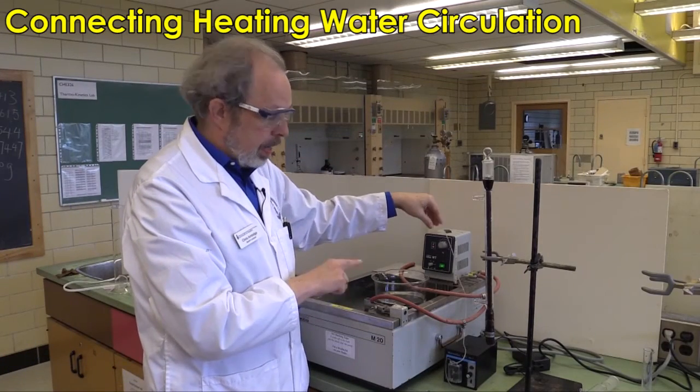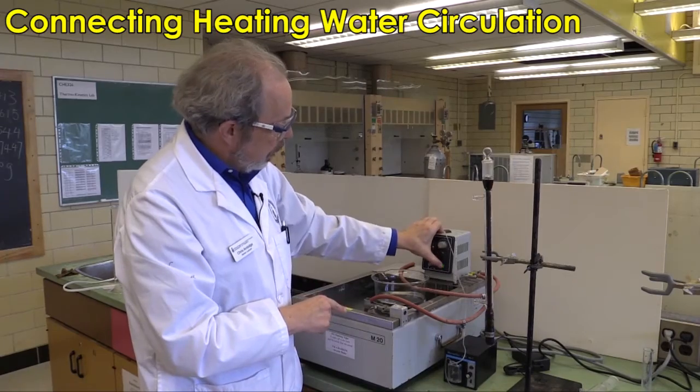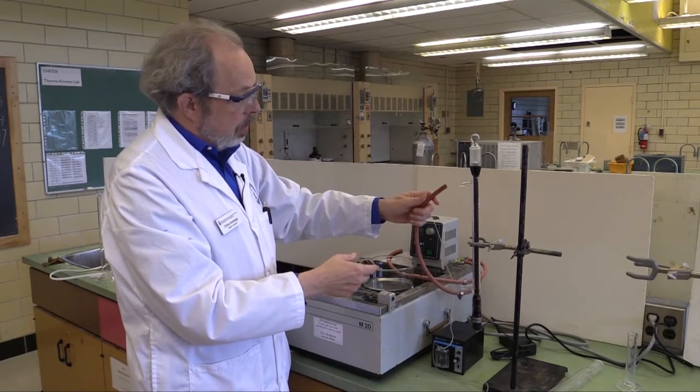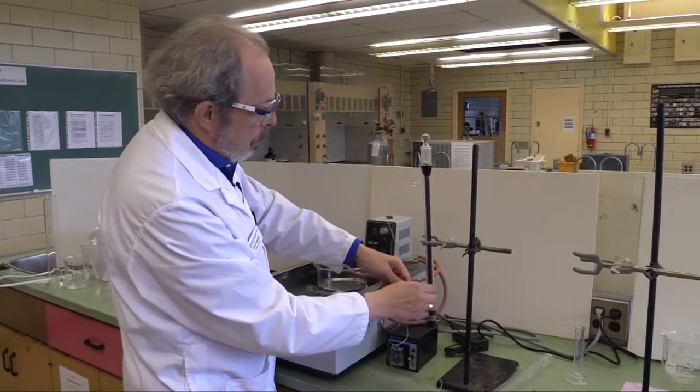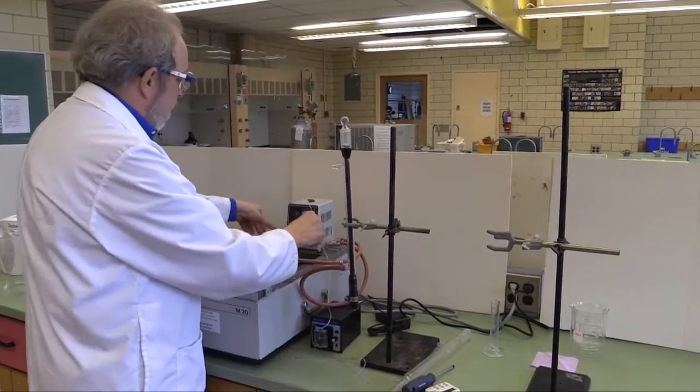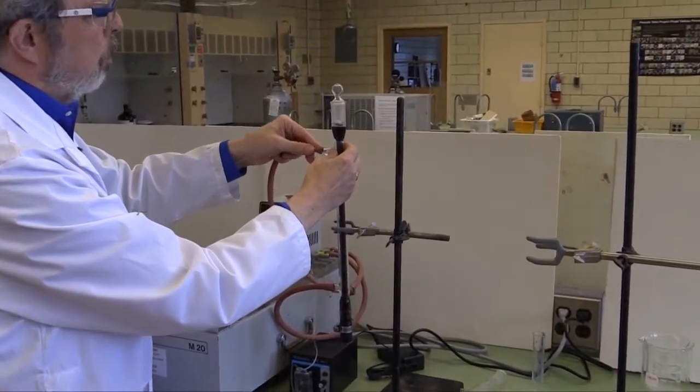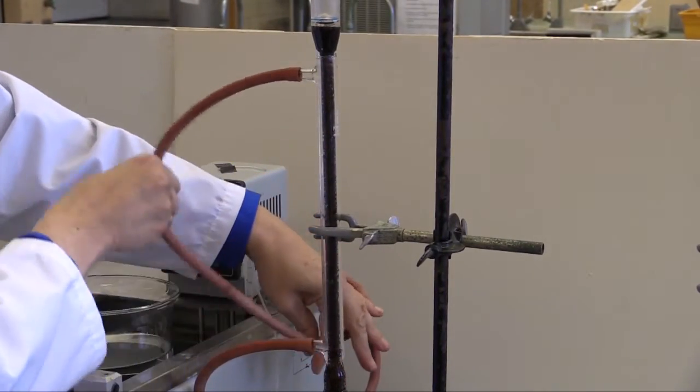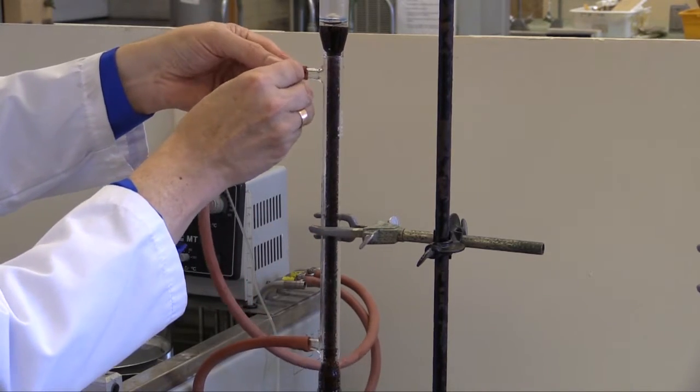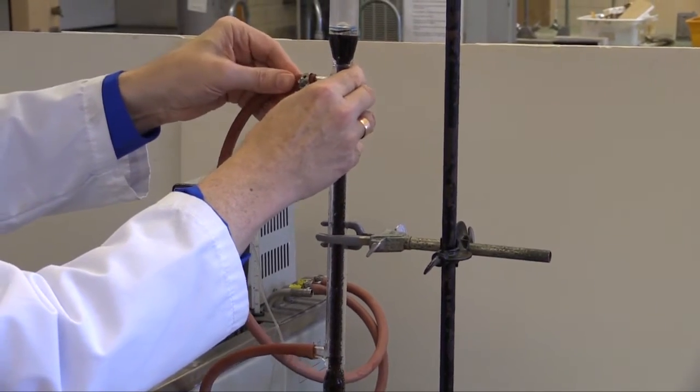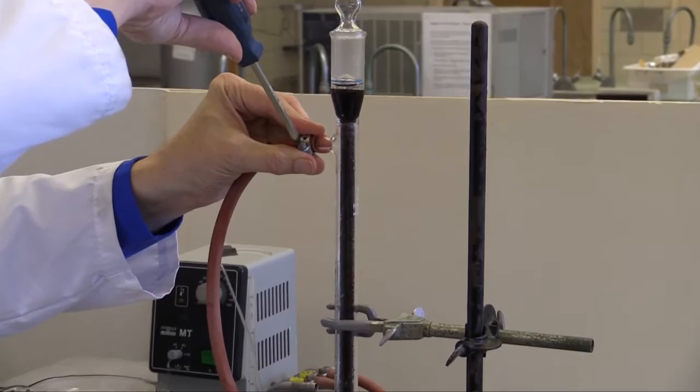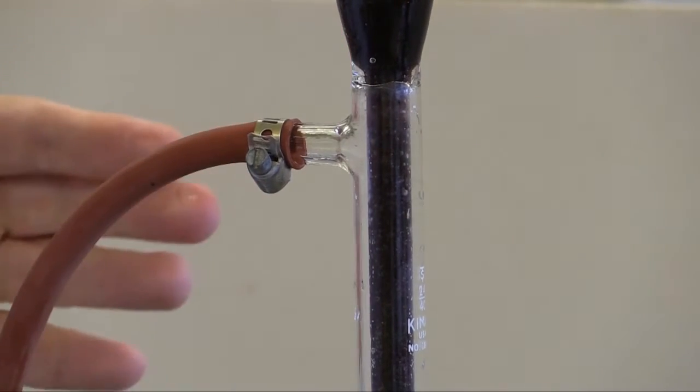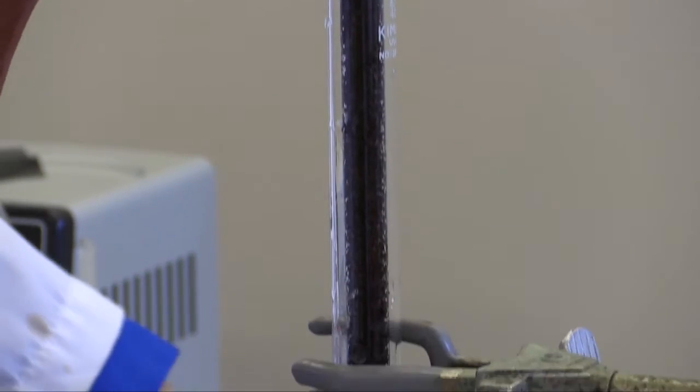Now we need first to connect the circulating water, and to do that you need to turn the hot water bath off for a bit, and one of these, you will have seen water flowing out. So you put the one that's flowing from the bath, connect it here, and the other one you connect to the top. Now to make sure that these don't pop off, they have got hose clamps on them. And you put that over the rubber tubing so that the glass is underneath.